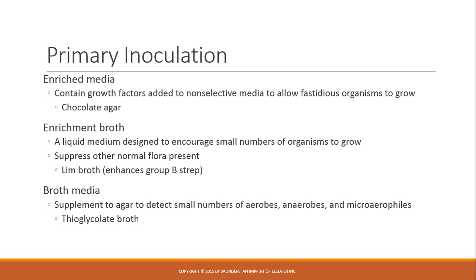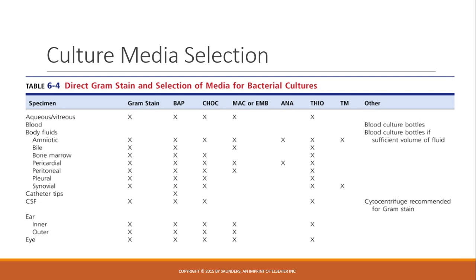And then there's also broth media that allows for small numbers of organisms, or anaerobes or microaerophiles. It's sort of a catch-all. Your thioglycolate broth is your catch-all broth.